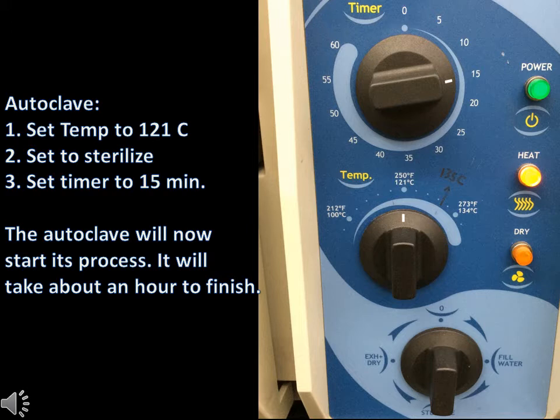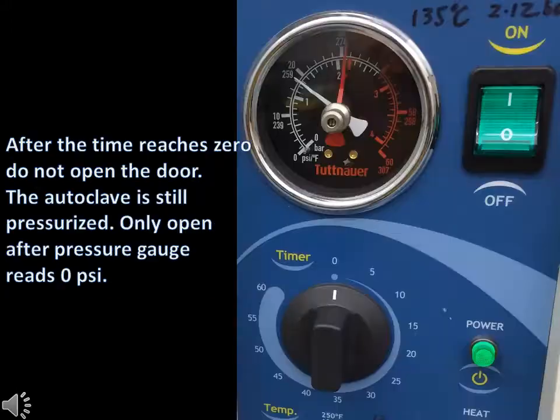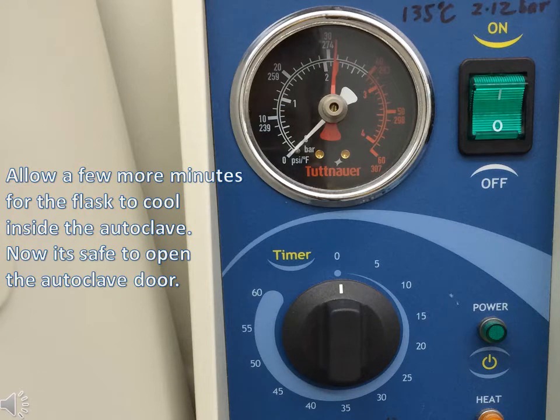The heat light will turn on and the autoclave will begin to accumulate pressure. The whole process should take over an hour to finish. When the timer reaches zero, do not open the autoclave. Only open the autoclave when the pressure gauge is reading zero psi. After the pressure gauge has reached zero psi, allow a few more minutes for your flask inside to cool down. Then you can open the door and retrieve the flask.